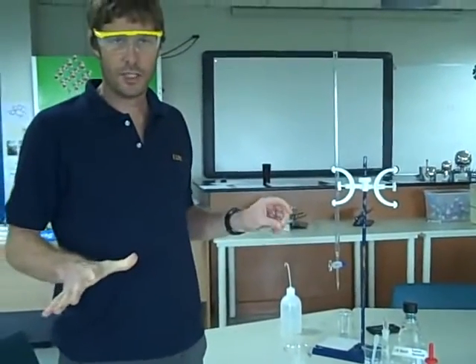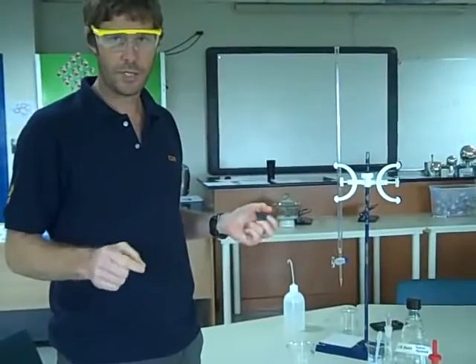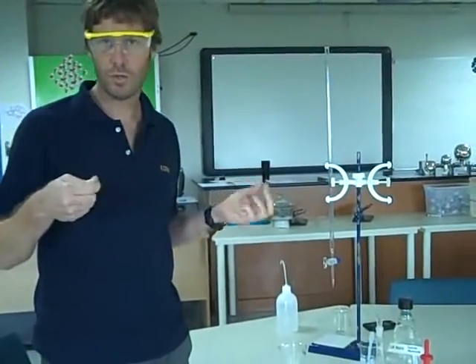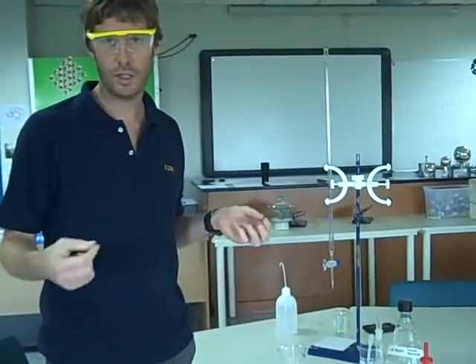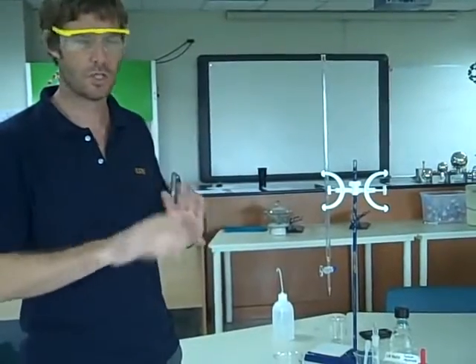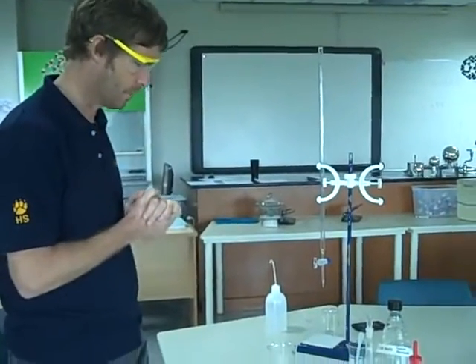You're carrying out a titration this week, if you're in the high level or the standard level class, to determine the number of moles of crystallization in oxalic acid. And to do that, we're going to carry out an acid-base titration, just a simple acid-base titration.